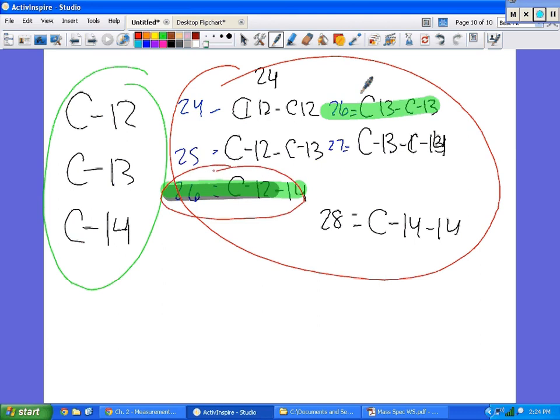What about sulfur? It has like 8. Well, I don't know how many isotopes sulfur has. That's true. It'll be the same thing. That's a good point. So S8, it would be way off the graph. That's a great example. S8, remember that we could have that? It would be so heavy, it would slam into the glass before it ever made the count. Does that make sense? You know, we have carbon-60 too. There's a low probability of it forming in that tube, but if it did, it would never make it to the reader.